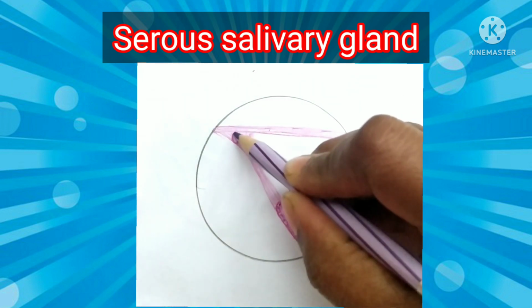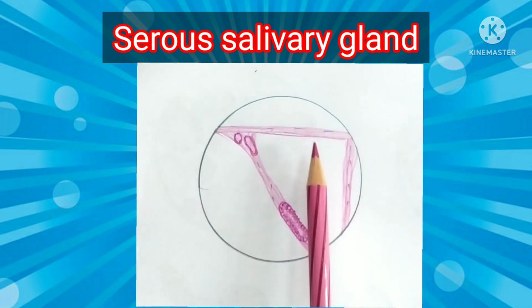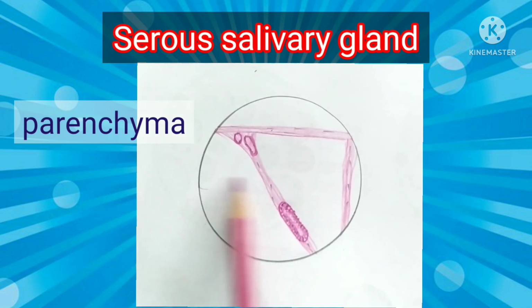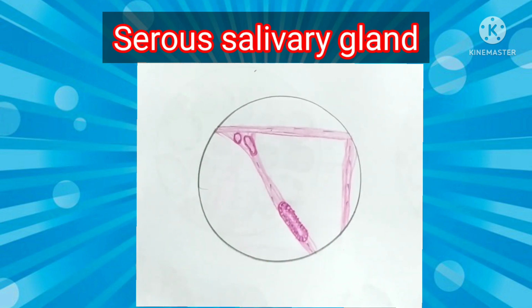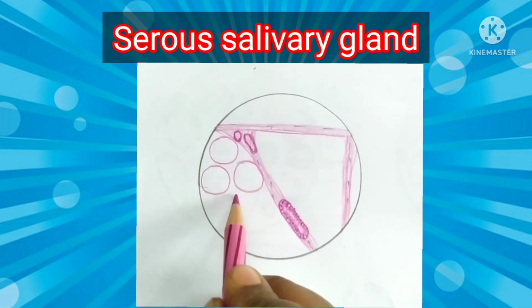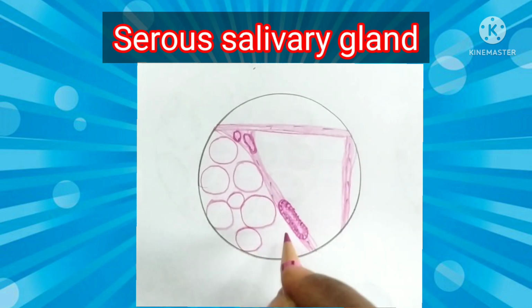The basic architecture of the salivary gland is the same in all three structures. The difference is only in the type of acini seen. The fibrous tissue forms the stroma and the acinar tissue forms the parenchyma of the gland.